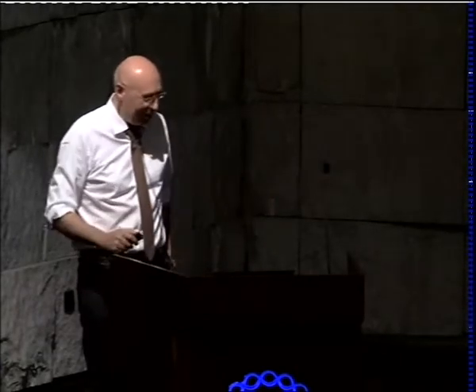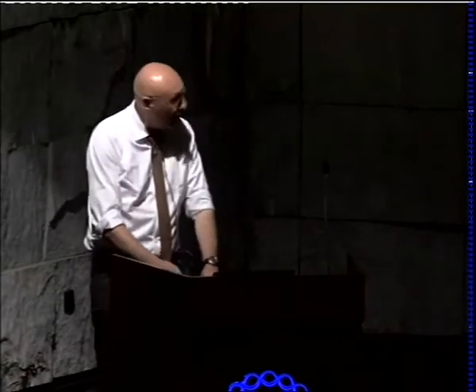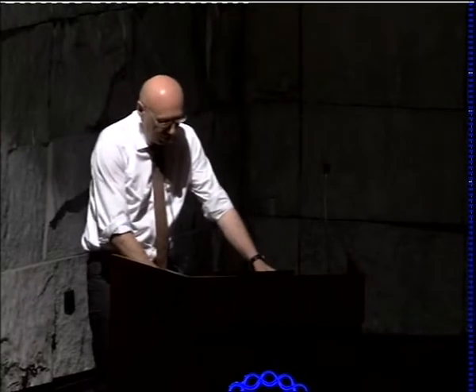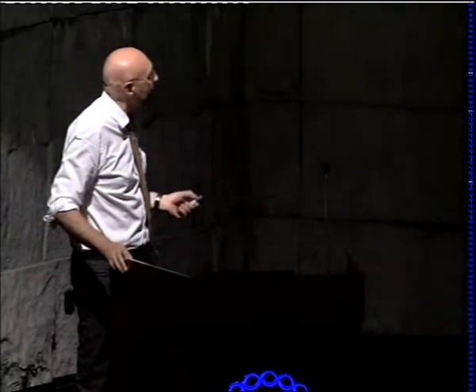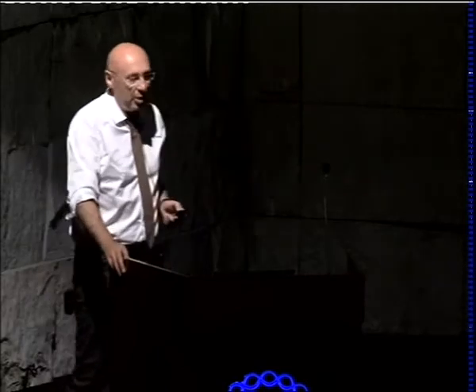It's, of course, a privilege to give this talk tonight and to tell you the story about super resolution and its basic principles. Now, we all know that throughout the 20th century, it was widely accepted, it was widely believed that the resolution of any light focusing microscope, at the end of the day, for all practical purposes, is limited to about half the wavelength of light, or to be more precise, to a value of d, which is given by the wavelength divided by twice the numerical aperture of the objective lens.